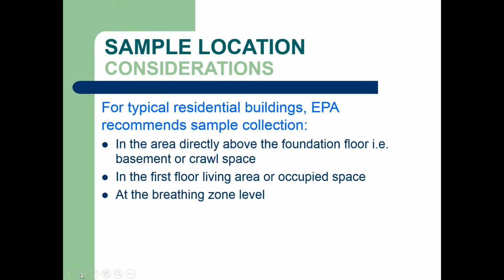So where do you place the samplers? EPA suggests that in a typical residential structure, samplers should be placed in the basement or crawl space to indicate a worst case scenario, and in the first floor living space to indicate typical exposure levels to occupants. And like with hygiene sampling, the devices should be placed at breathing zone level.